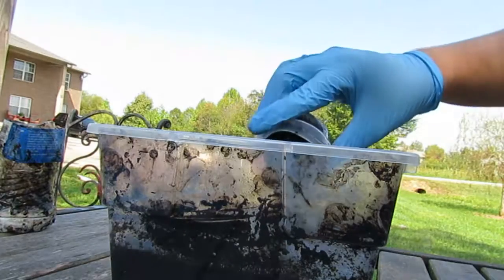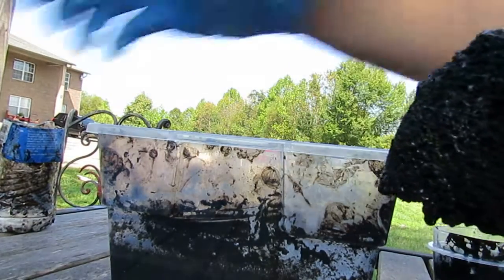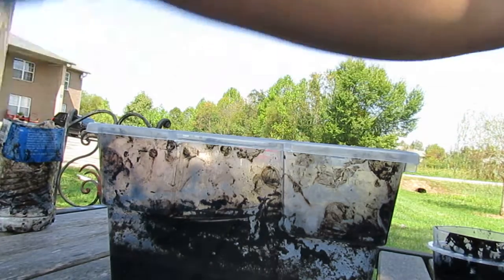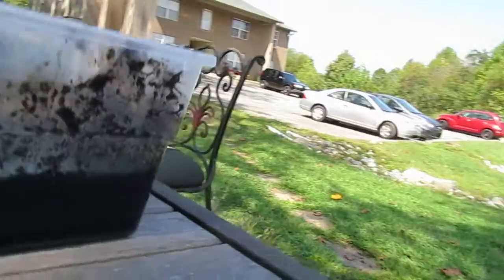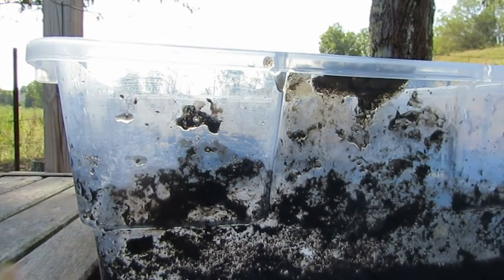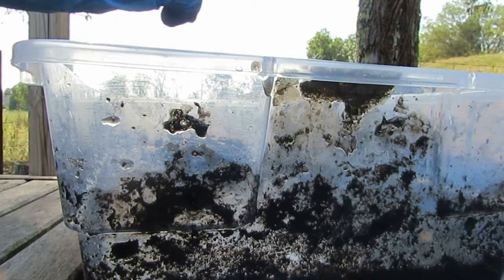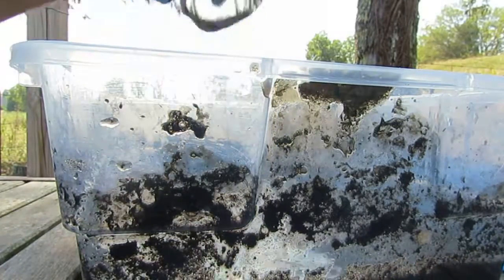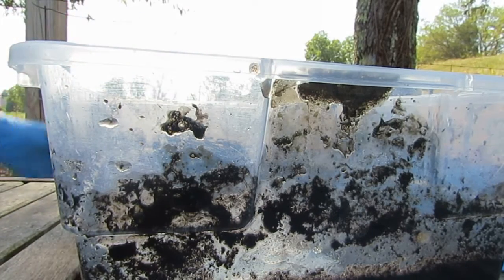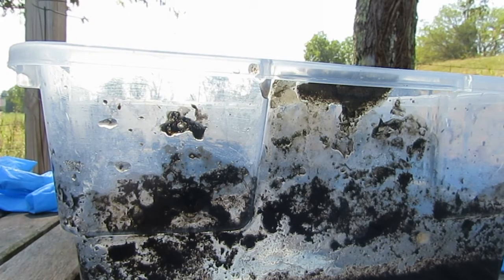I am going to add this water into there because these are the same things. I'm going to get a little bit of distilled water. It's finally cooled down because the water I just added was cold. Now I need to add baking soda, so now we are neutralizing acid.